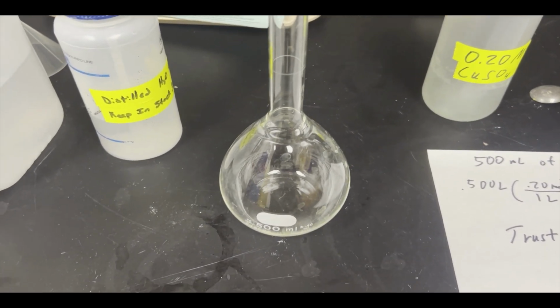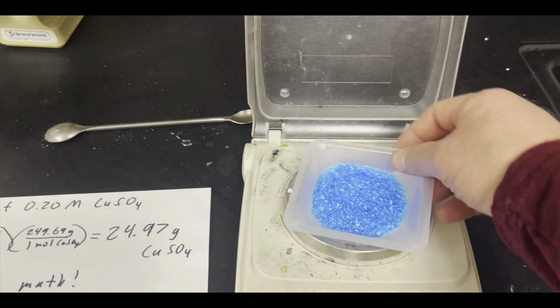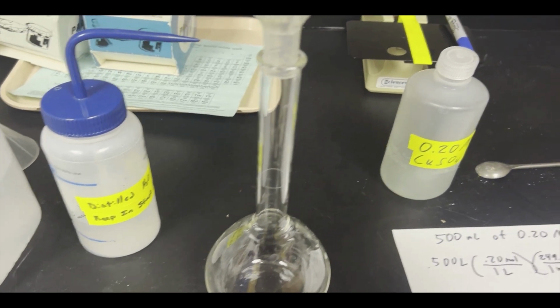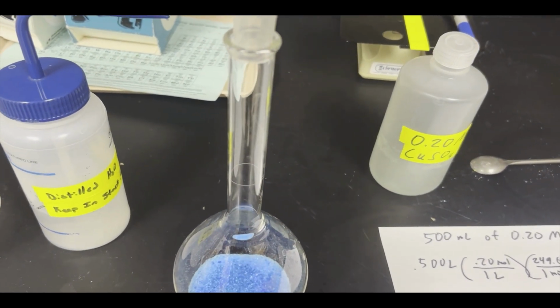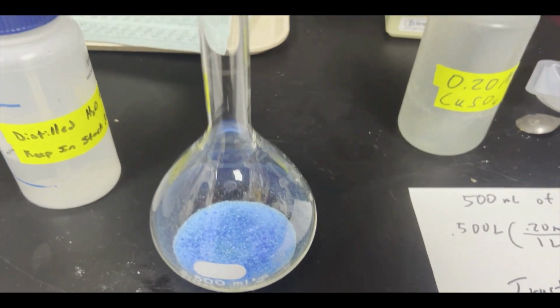Now, you can do it one or two ways. You can add a little bit of water first. That is kind of a standard way of doing it. But you can also start with the solid if you prefer. So I'm going to start with the solid because I don't like it when the solid touches a wet neck of a flask, and that actually causes it to stick. I just don't enjoy that.